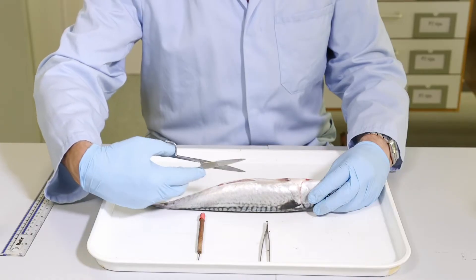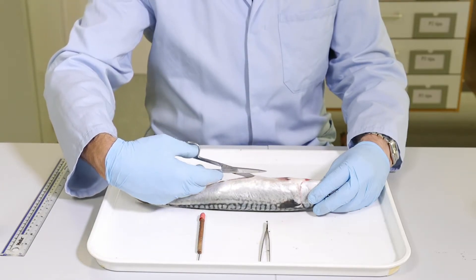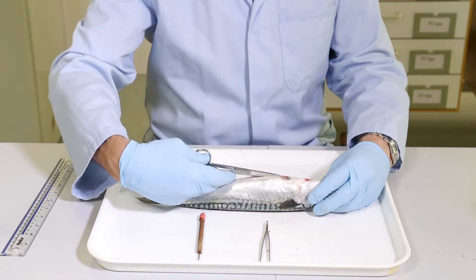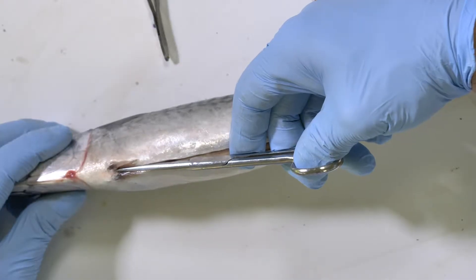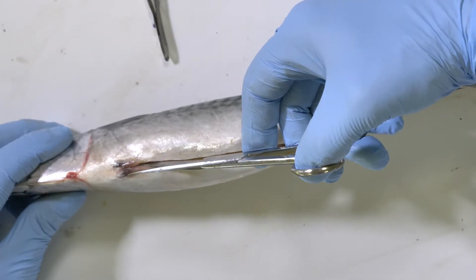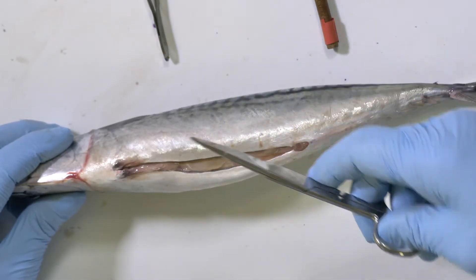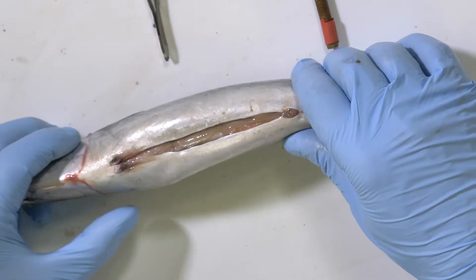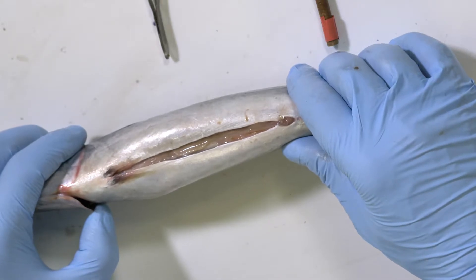Be careful not to insert the point of the scissors too deep into the fish, because then you risk damaging some of the organs within the body cavity. Particularly, you don't want to damage the gut because if the gut contents leak out that can make it very much more difficult to subsequently inspect the contents of the gut for the presence of worms. You'll get to a point near the gill arches of the fish where cutting becomes more difficult, and so that's the place to stop.